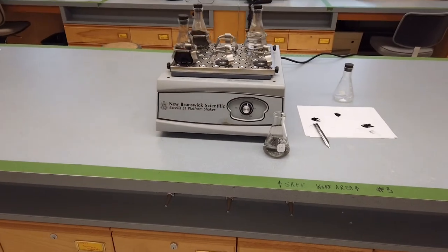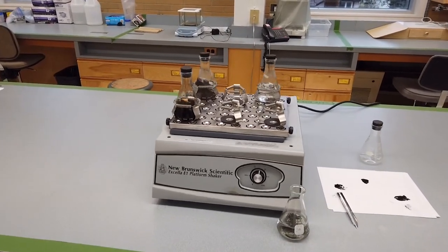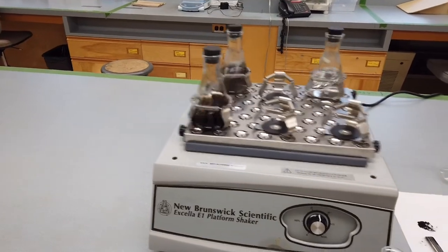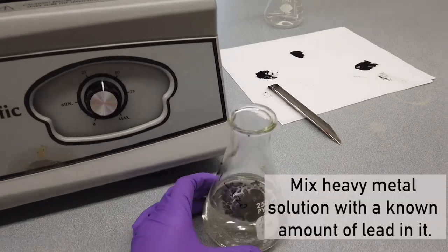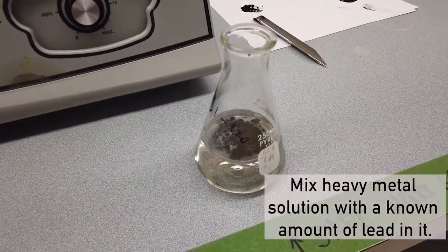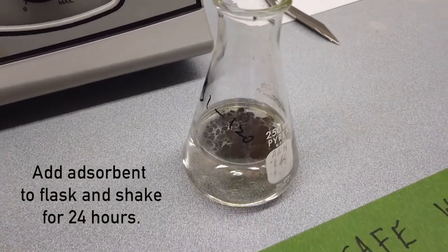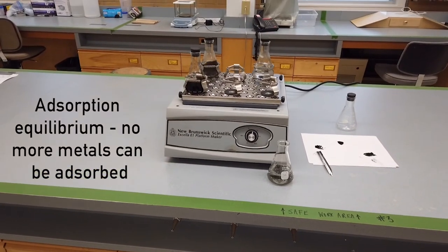To test how well these materials absorb the heavy metals, I need to use a shaker. This is used to mix or agitate substances in a tube or flask by shaking. First, we mix the heavy metal solution which has a known amount of lead in it, then put adsorbents in it and shake for 24 hours until they reach adsorption equilibrium.